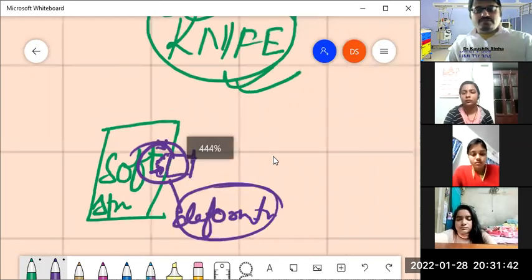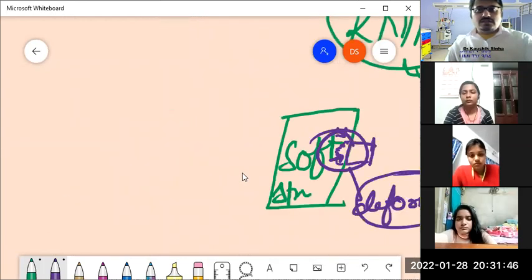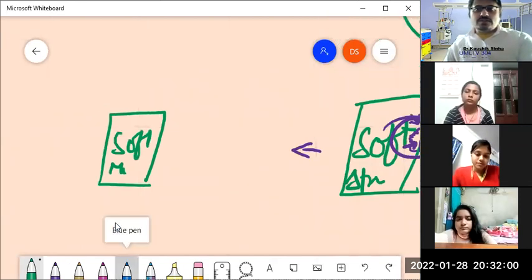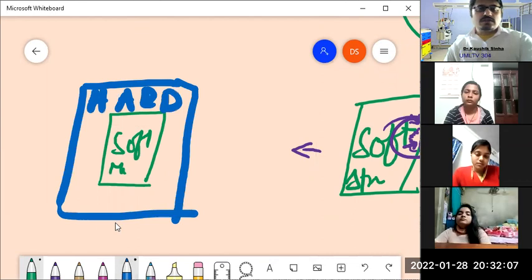We have to first embed this soft material. Let me demonstrate the process out here. If this green color again represents the soft material, if this soft material is embedded into something that is relatively hard, so anything that is hard would resist deformation quite naturally.